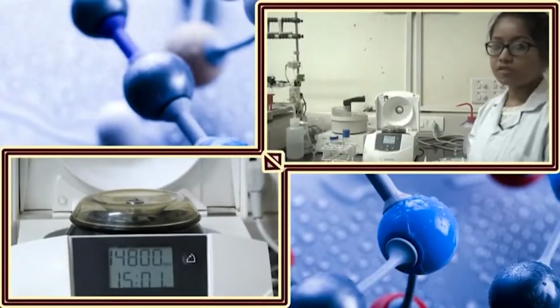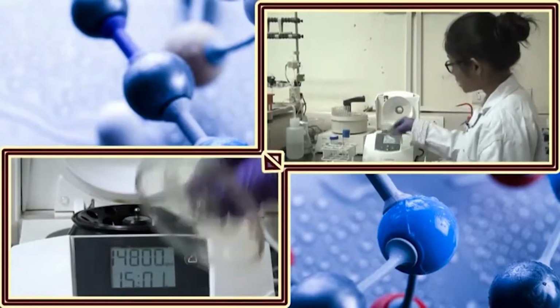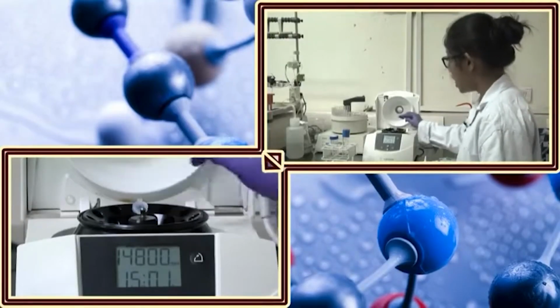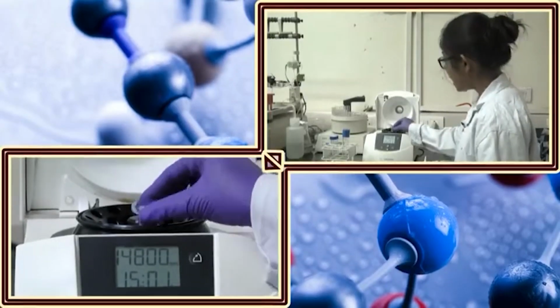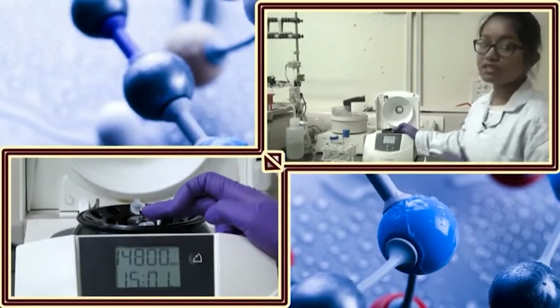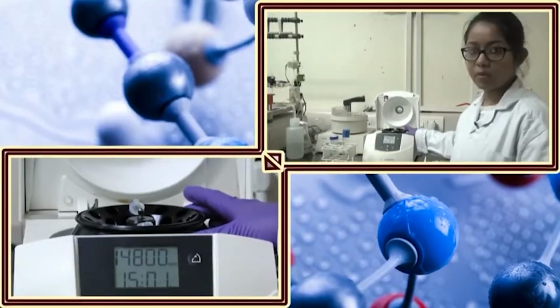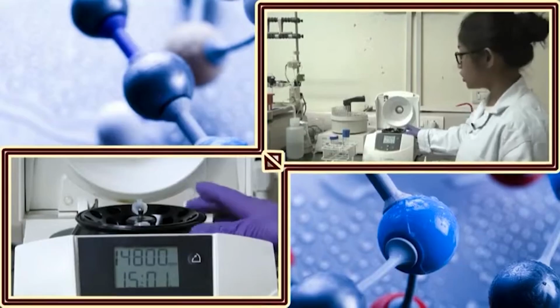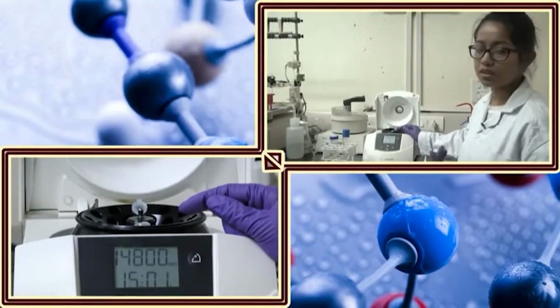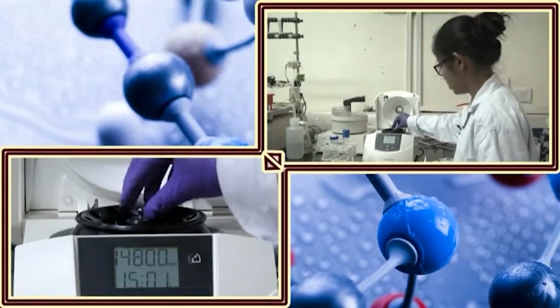As I am removing the lid of the centrifuge, if I am putting one of my solutions here, I have to put another sample of the same weight at the opposite side, otherwise it will damage the rotor, it will not give a proper value, and the centrifuge will show an error. So, you always have to balance your sample. If you have one sample, then you have to balance it with some other solution like water or something else, otherwise it will damage the centrifuge rotor.